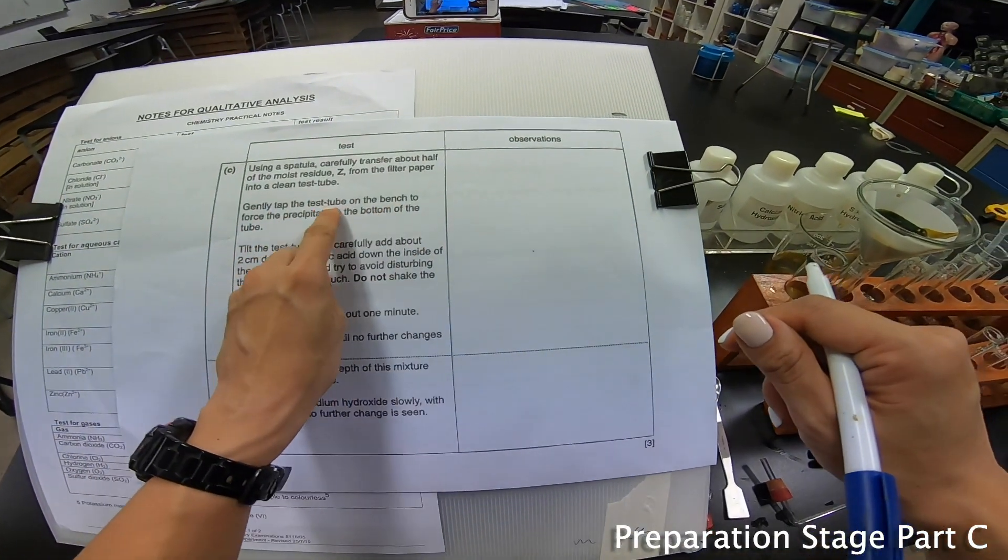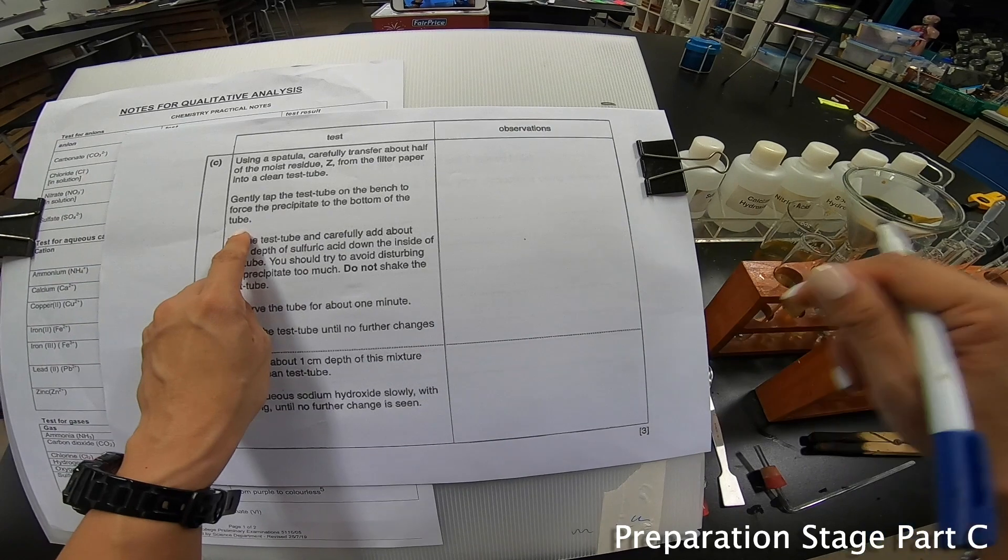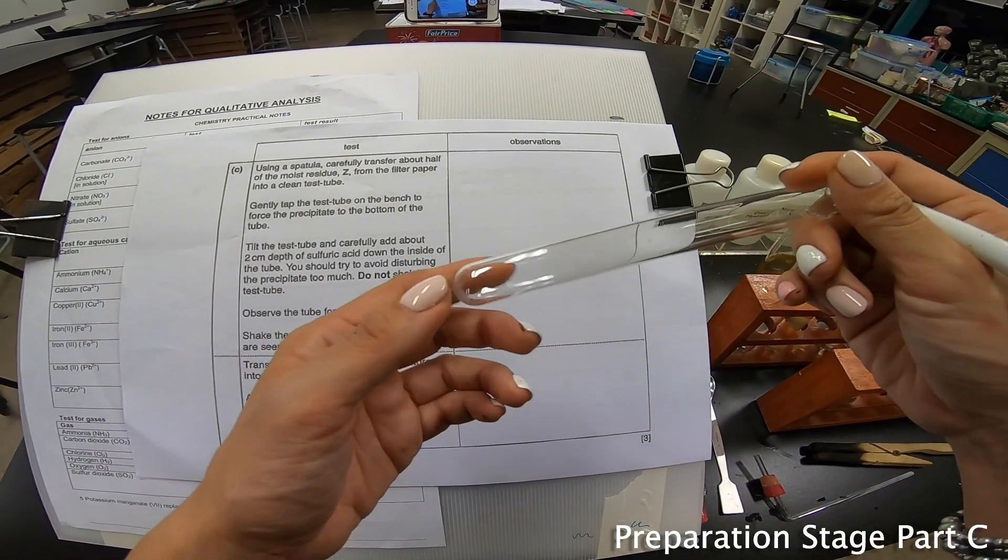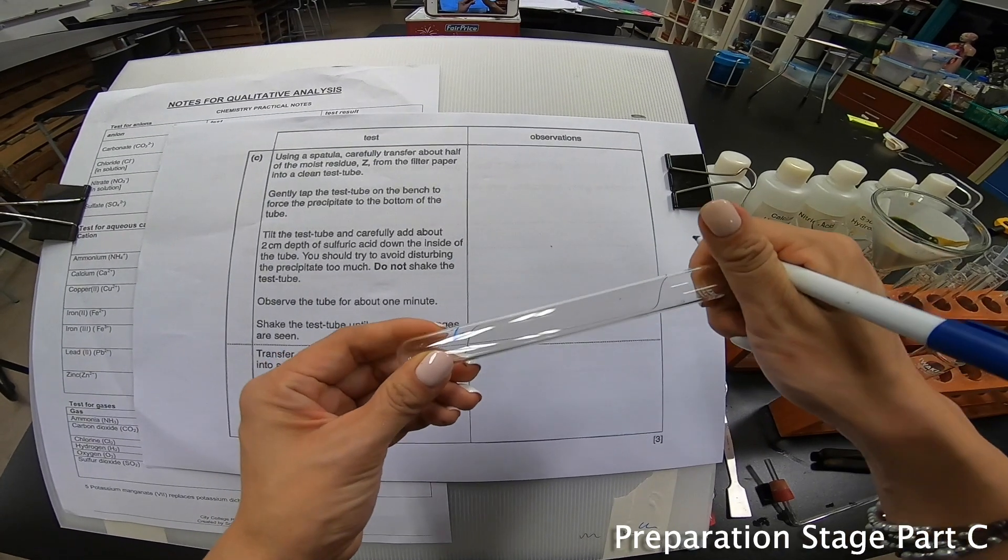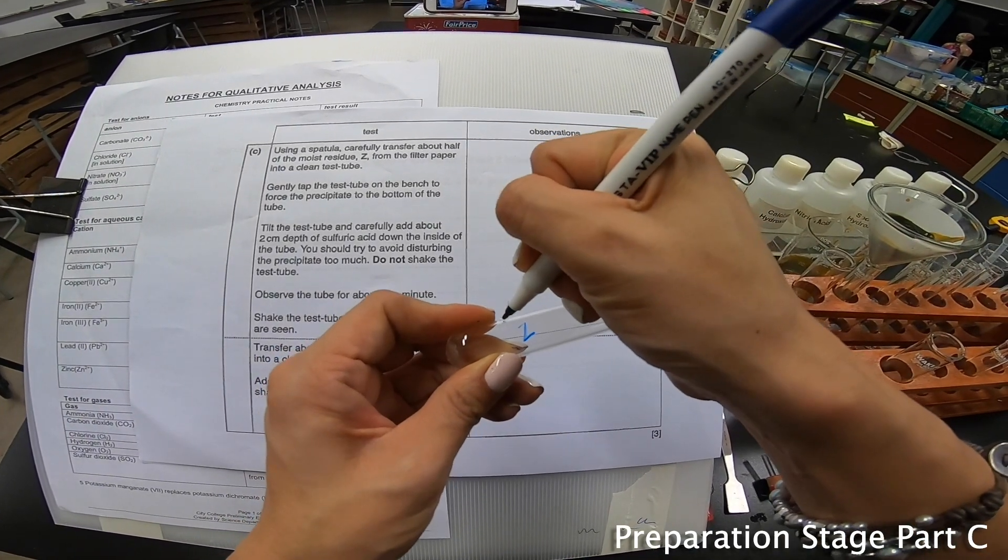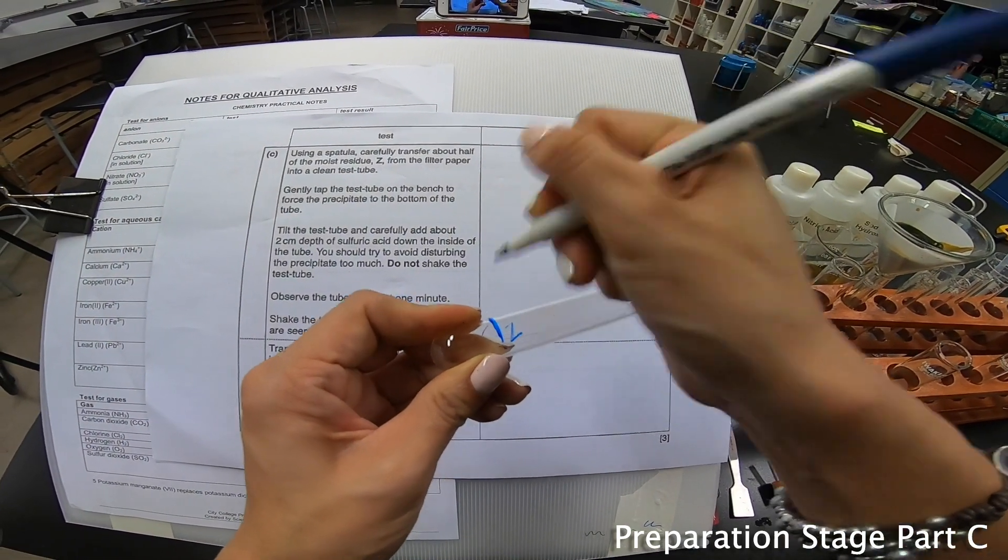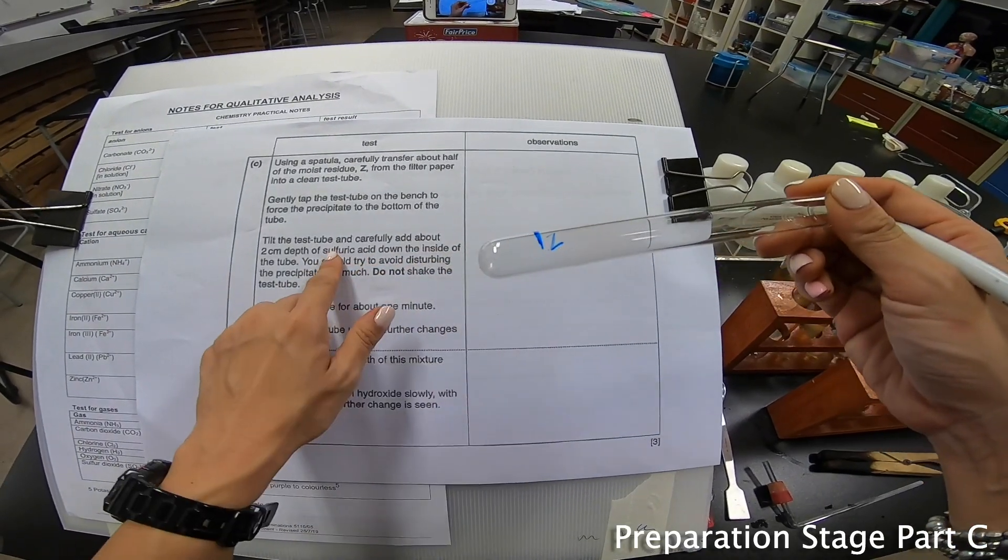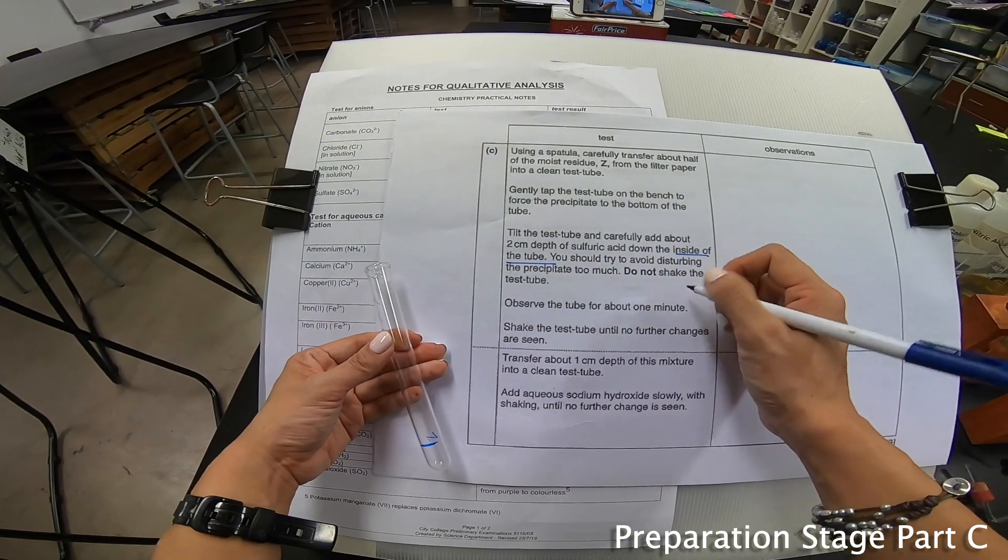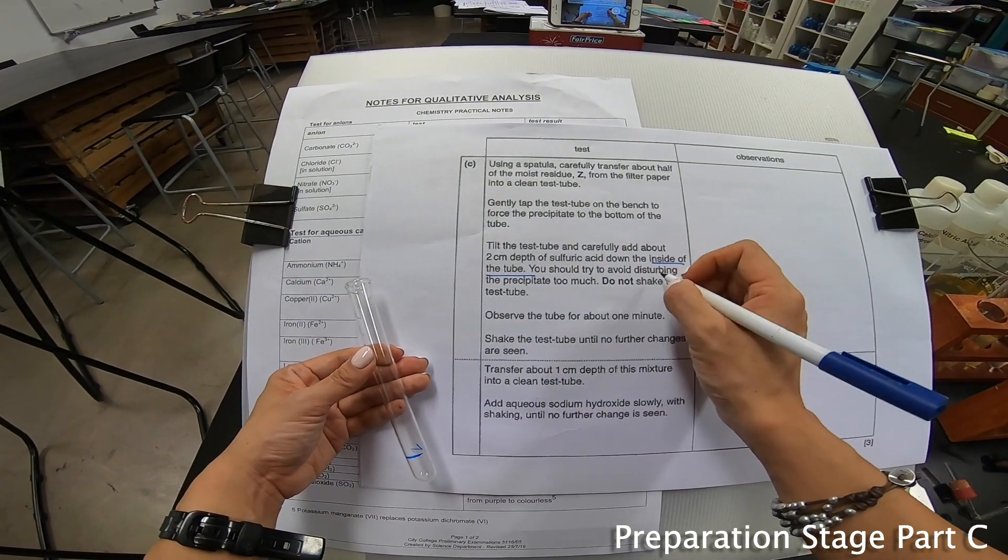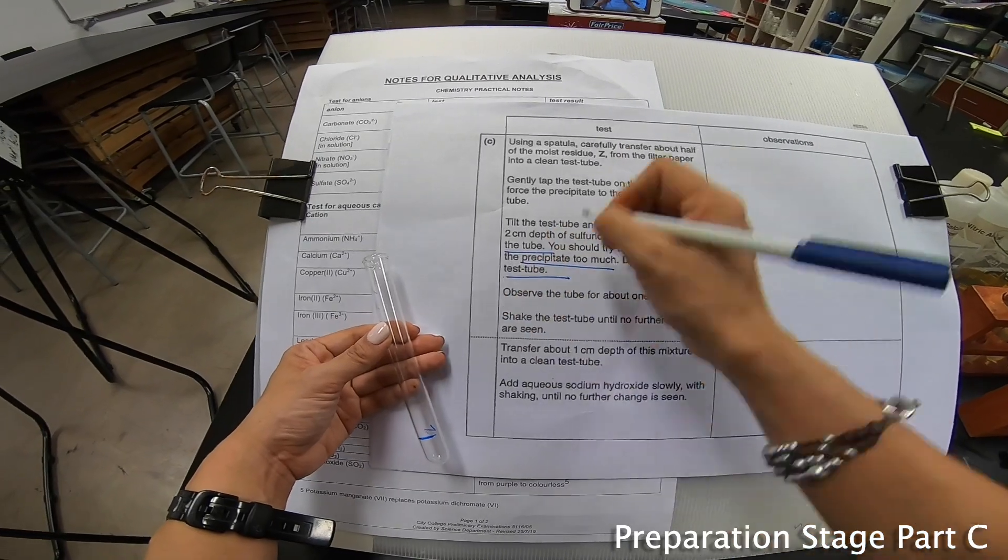Gently tap the test tube on the bench to force the precipitate to the bottom of the test tube. I'm going to write down Z, and then to this add about 2 cm depth of H2SO4, which is sulfuric acid, down the side of the test tube. You should try to avoid disturbing the precipitate too much. Do not shake the test tube.